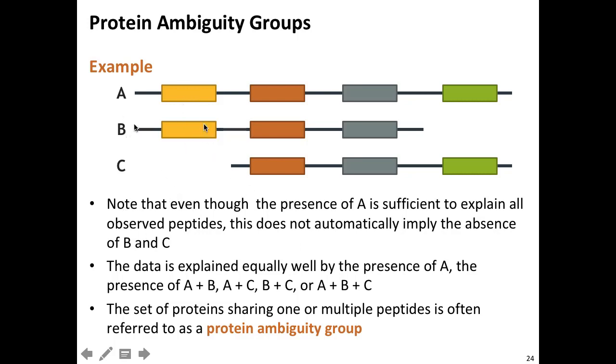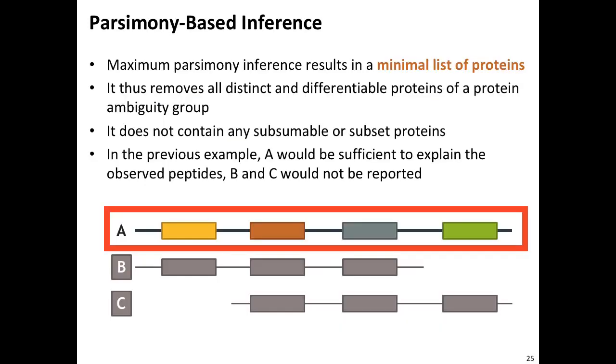Because you should be able to observe that if this guy here changes independently of that guy, then it cannot be all A. Yeah? So it has to be, well, either B and C, or it has to be A and A, either of those. Yeah? But through this type of argument, you can start inferring what is really present in the sample and what is not present. But from the observation of just the qualitative data alone, you will not get very far.